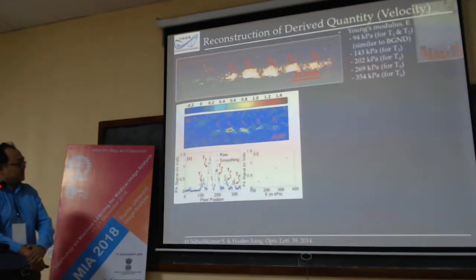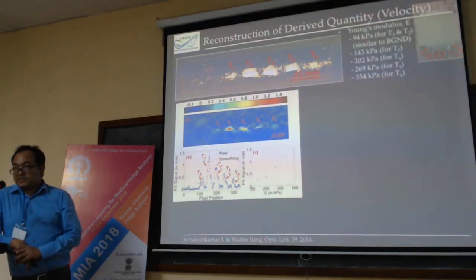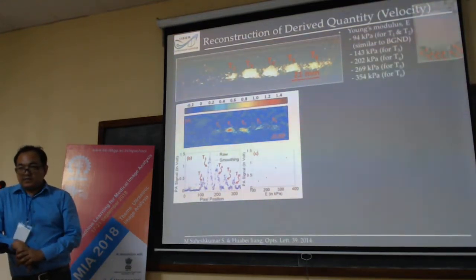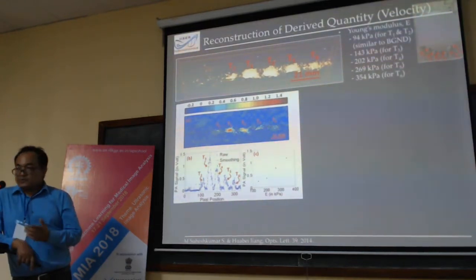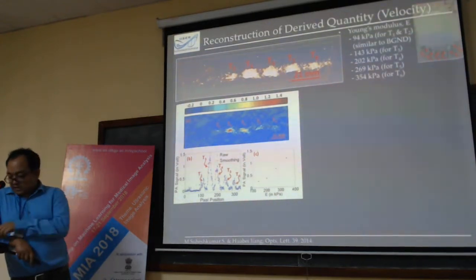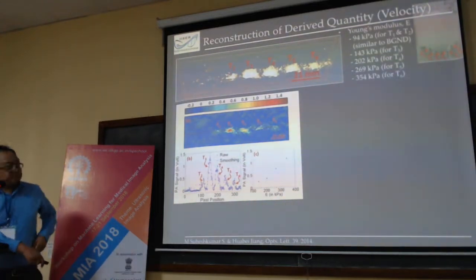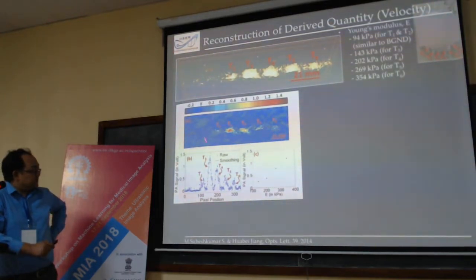Other than this, we also looked at whether we can derive the elastic property of the samples from the measured photoacoustic signal. The idea is that if we see the right-hand side of P naught, it is given by beta over C_V, and the absorption coefficient. Here on the right-hand side is the Grüneisen coefficient of expansion, which is a characteristic of the elastic properties of the medium. If there is a change, then we can get the mechanical property from this. This is about the characterization.